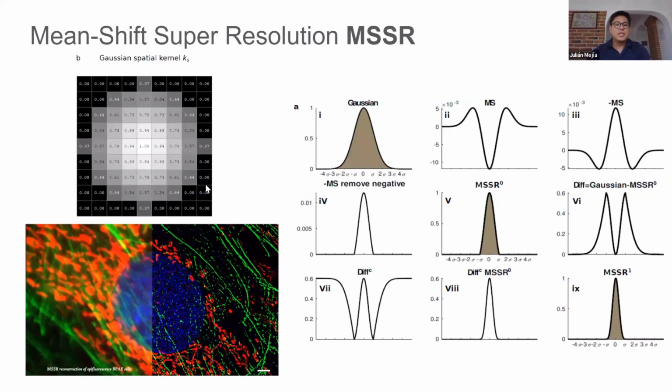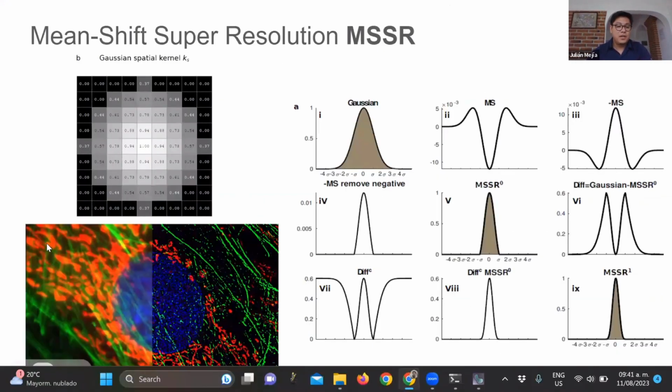So what you do is, again, you have, for instance, a ground truth image, taken from some confocal, for instance, in here. You define, in this case, the working ROI by defining the full width at half maximum of the point spread function of your optical system. That defines the minimum structure that you can resolve in your image, and that is the region that you keep to work. And what work do you do in this region?